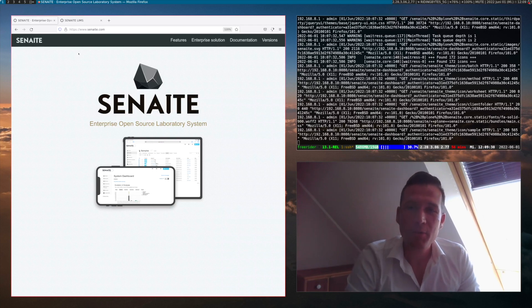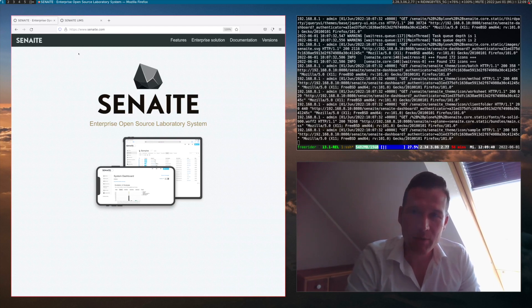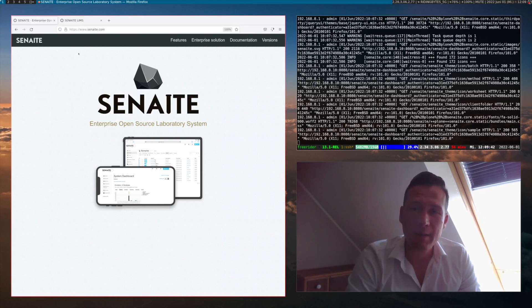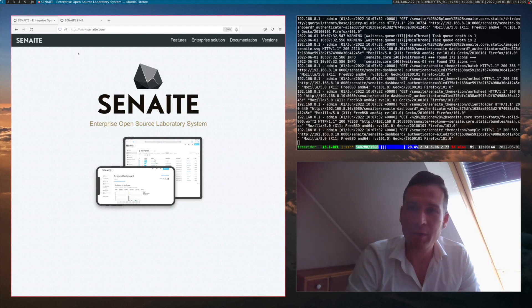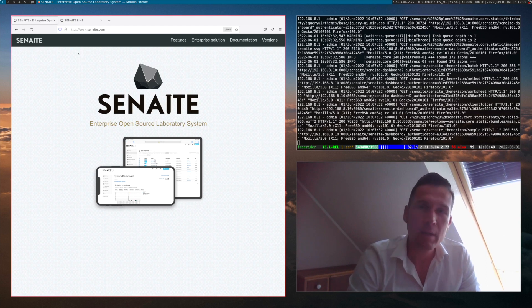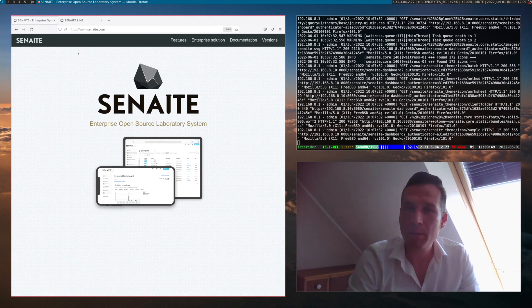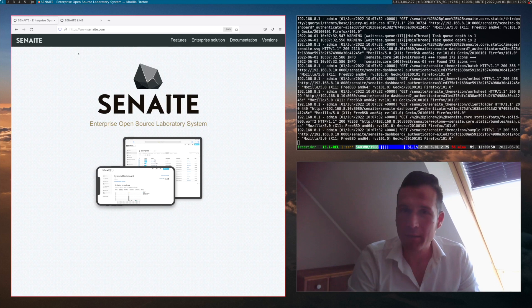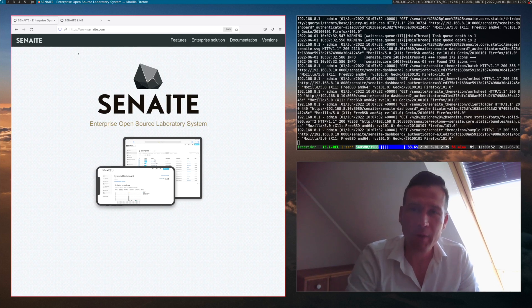Before you can register your first sample inside Synate LIMS, you need to have some basic data in place in your system. For instance, the laboratory information, analysis services, categories, departments, and of course some clients you can create the samples for.